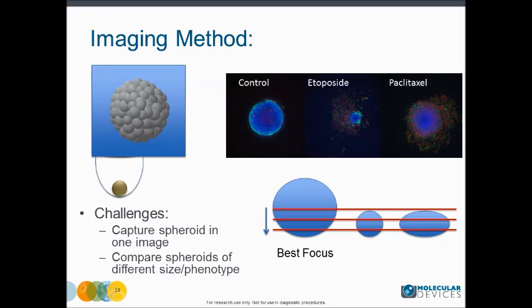Imaging of 3D cultures and spheroids presents other challenges. First, we have to use a stack of images, one site per well. It is essential to capture large objects without splitting, and it is very convenient when spheroids are in the center.